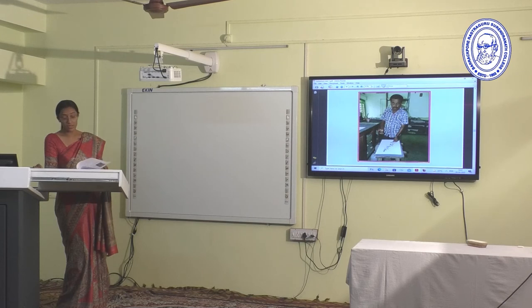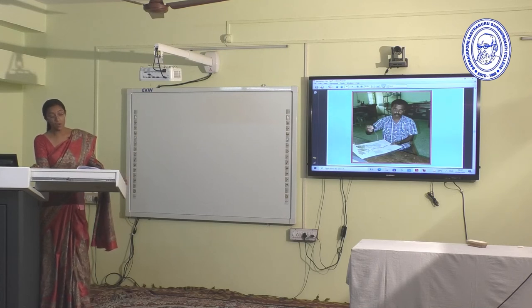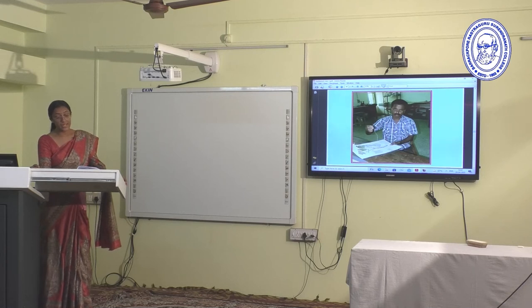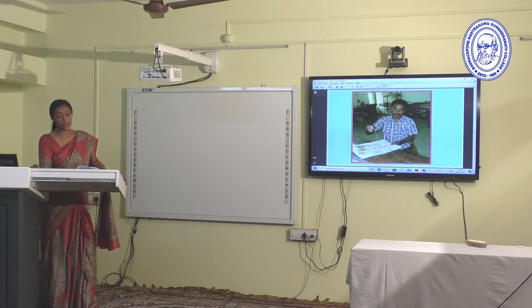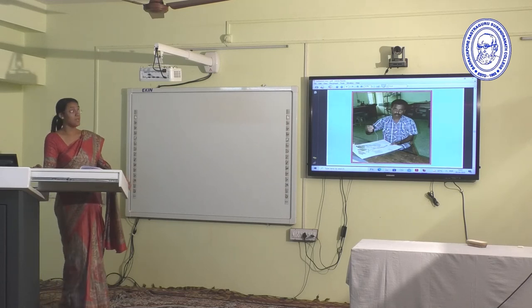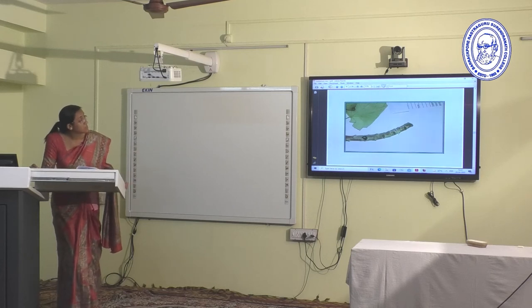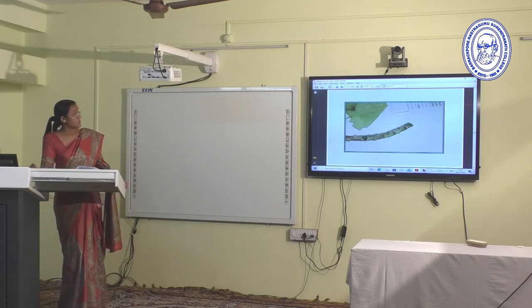For stitching, stitches should be small and independent — the thread should not be carried from one stitch to another on the lower side of the mounting sheet. On each side of the stem, a hole is made, a thread is inserted, and a knot is put at the back; the thread is cut after each knot. This shows the stitched portion on the herbarium sheet.